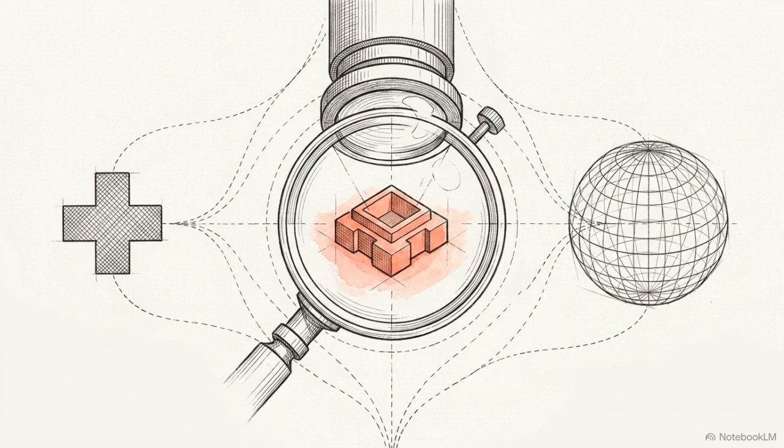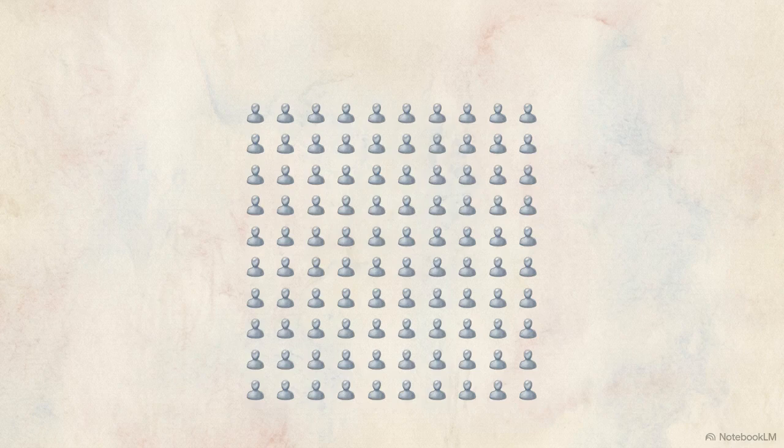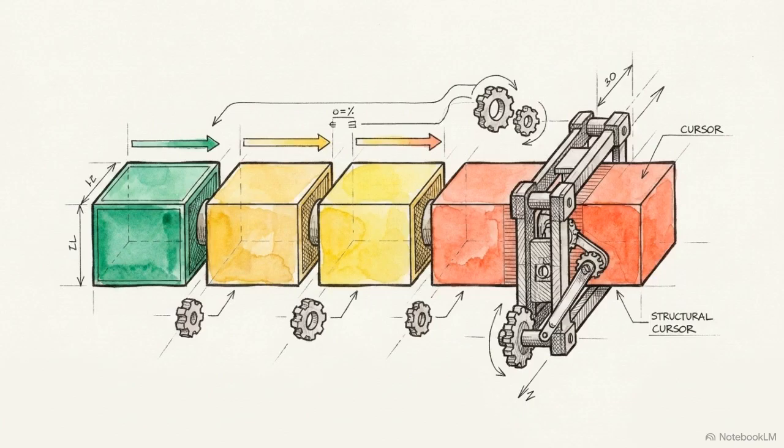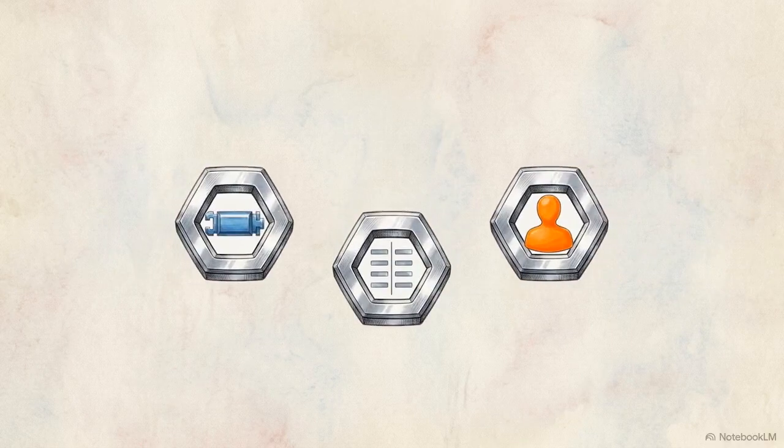The final step is annotation. The structurally validated variant is cross-referenced against global databases like ClinVar and gnomAD. Population frequency data from gnomAD reveals if a variant is common in healthy individuals, while clinical reports from ClinVar help determine if it is a known disease driver. Only variants that survive this entire gauntlet are assigned an official ACMG classification, ranging from benign up to pathogenic.